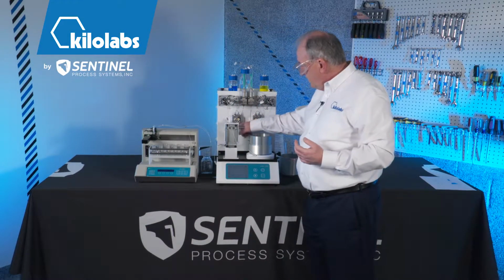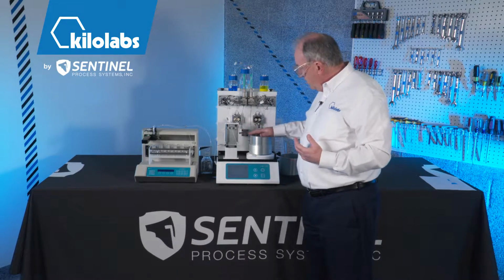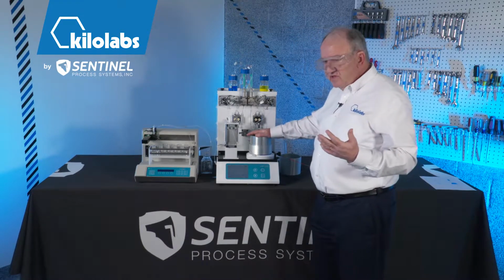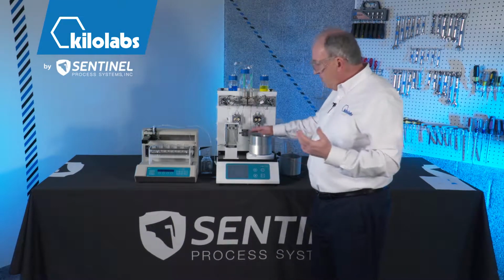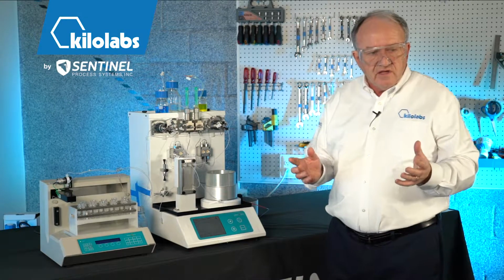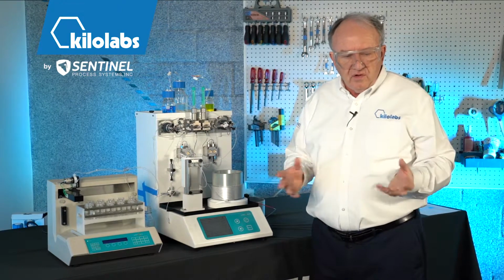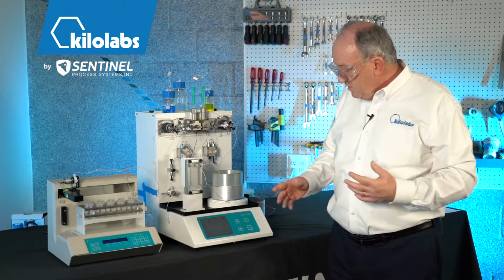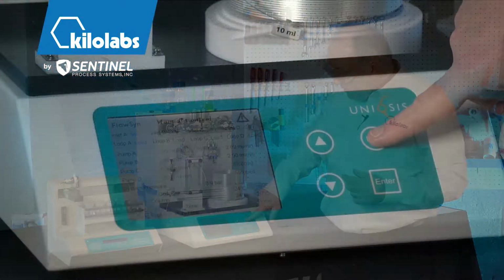And then from here, we have a back pressure regulator that is in essence imposing a pressure on the system. It's set at 7 bar. So the pressure drop across the open coil is only 2 bar. So in essence, it gives you a sense of how the system is operating and what to expect under manual conditions. And also, if you want to calibrate the pumps, you could take the flow offline, put it into a graduated cylinder, and in the course of going through the graduated cylinder, make sure that the pumps are delivering what you want to, which is another major attribute of these systems: there's no measurement of the flow. You rely on the pumps to deliver the flow that they say they're delivering, and you do the measurements in between. That saves a lot of complexity and also cuts back on your ability to have to troubleshoot the system.